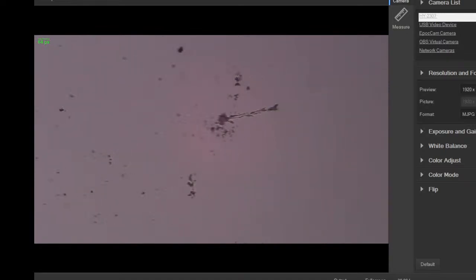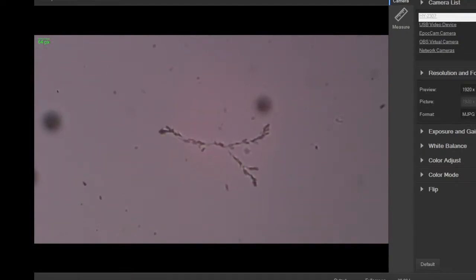You get these little crystalline formations from stuff, often forming as the slide sits here and starts to dry out, but it can be for any number of things. Not sure what those are exactly. Interesting patterns though.